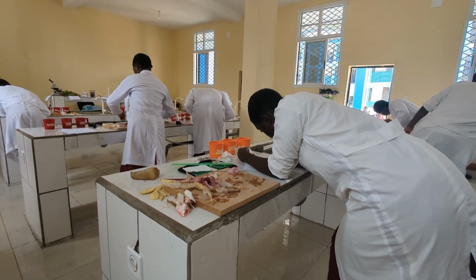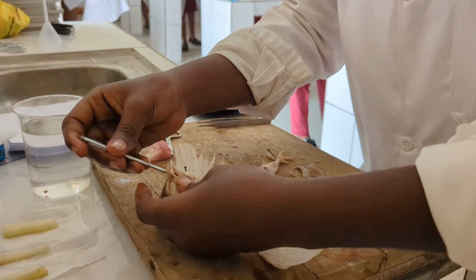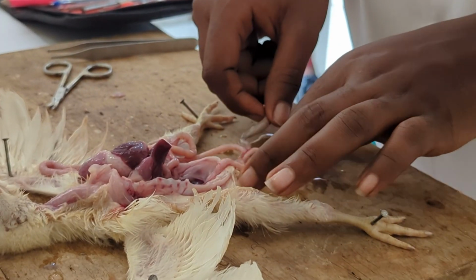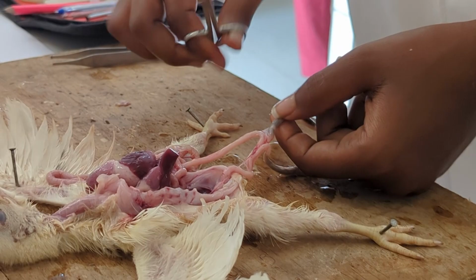Then we gently removed the intestines, the digestive diverticulum, and other parts of the fowl. Then, since we were dissecting from the left, we had to display our organs to the right, and this is something that a lot of students really do forget during their examination. Although it is so small, a lot of students forget and lose a lot of marks.